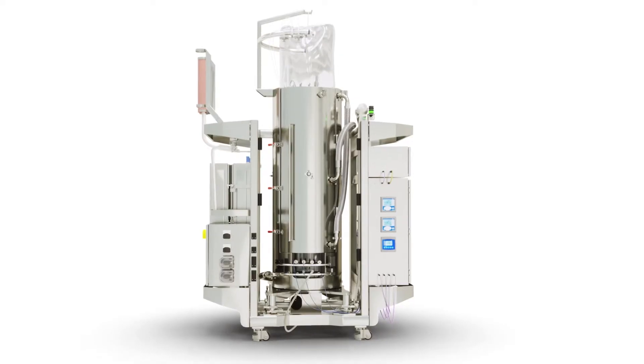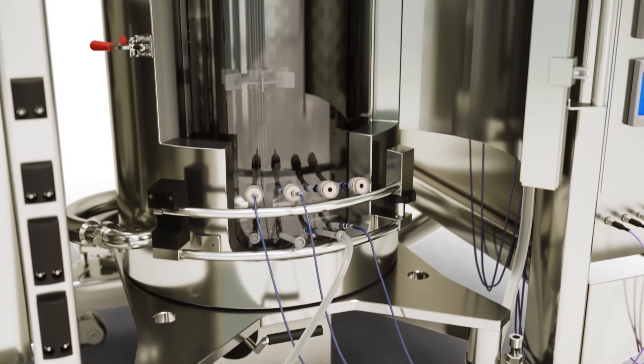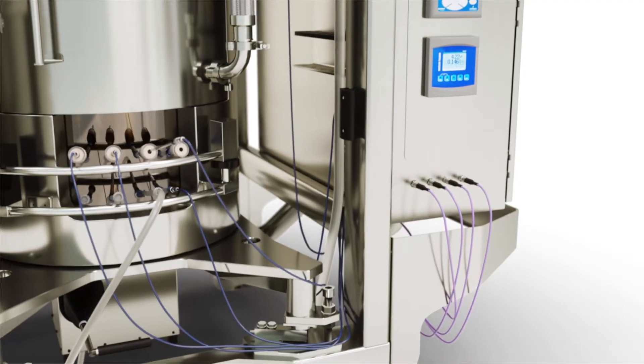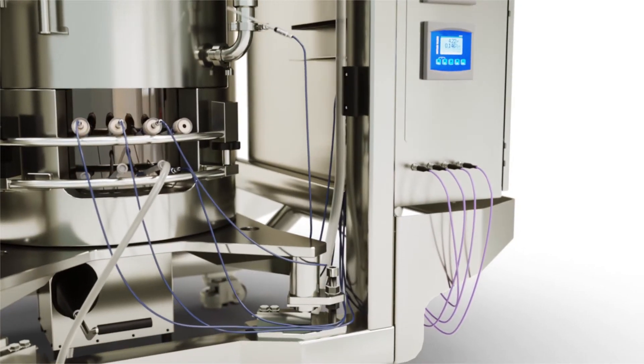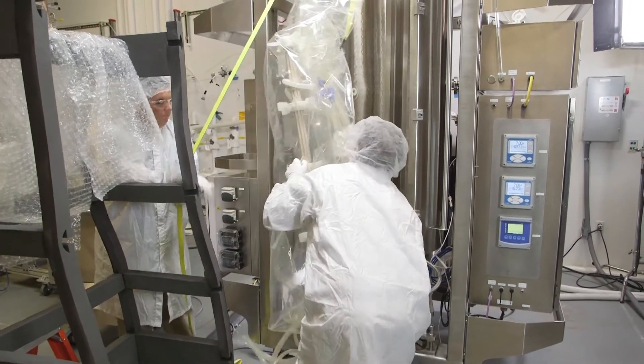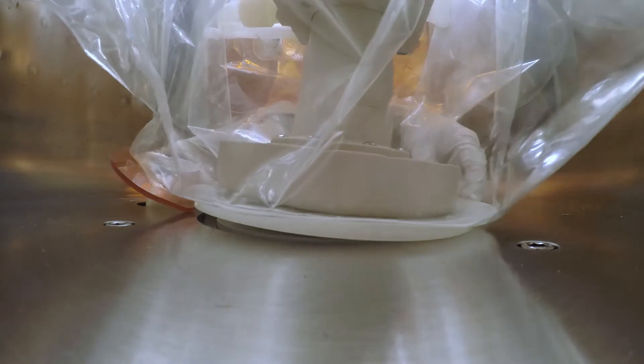The single-use bag contains the full assembly required for fermentation. The bag assembly includes the impeller, sparger, probe, and sampling ports. This video will show you the key steps for installing the disposable bag and accessories. As you will see, it is a straightforward process.